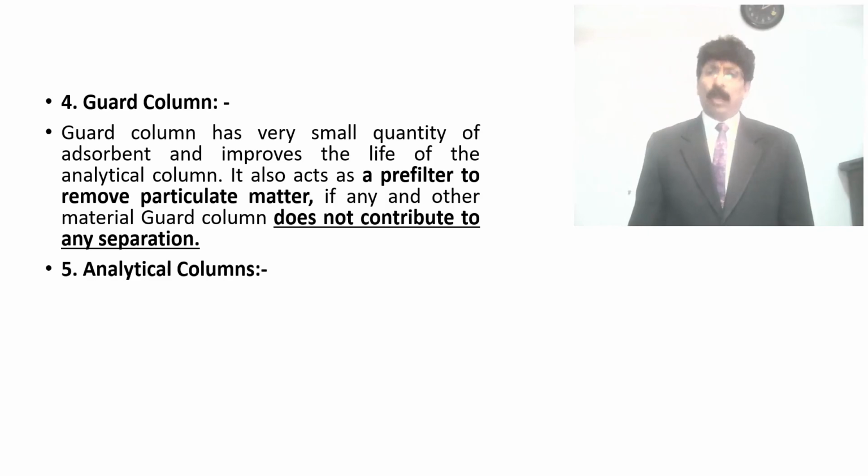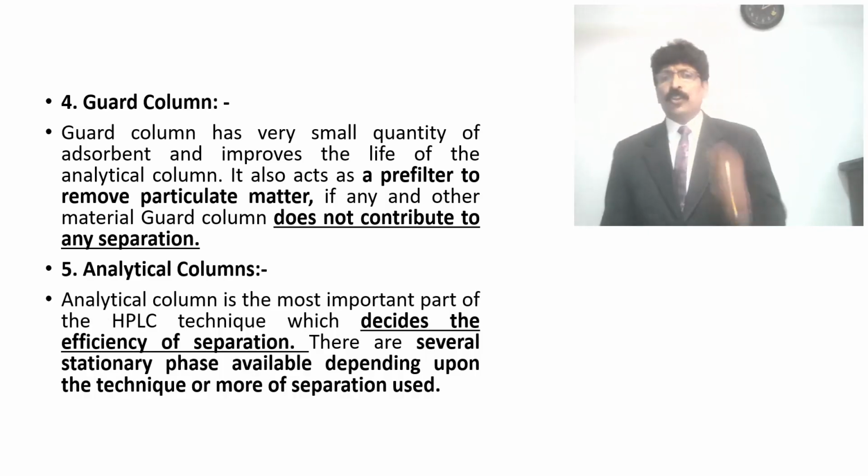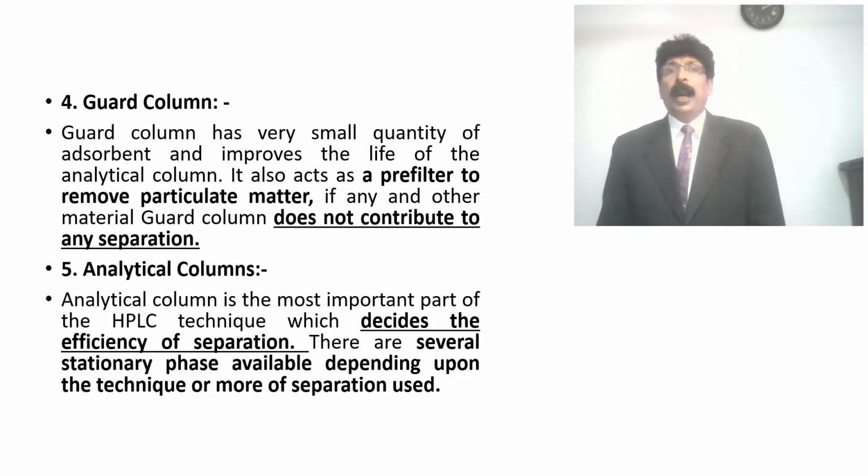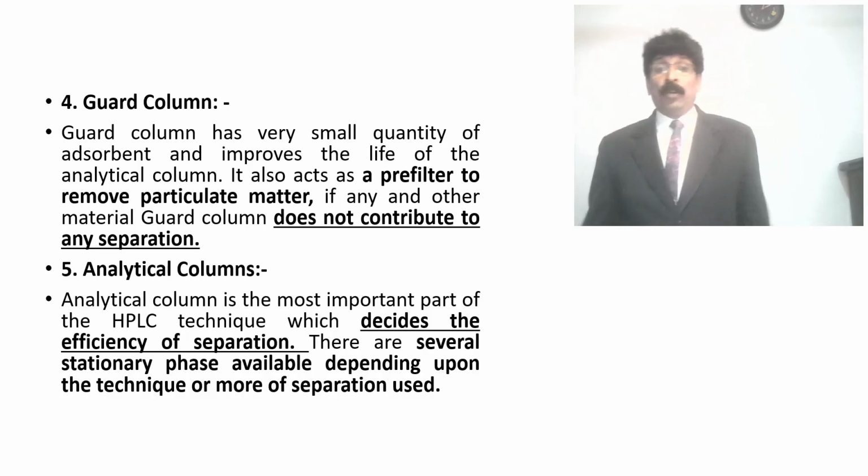Analytical column, this is a very important column. The analytical column is the most important part of the high performance liquid chromatography, HPLC technique, which decides the efficiency of the separation. There are several stationary phases available depending upon the technique or mode of the separation used.